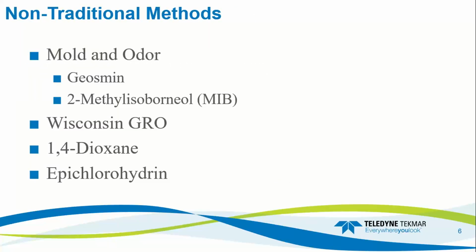Many of these non-traditional methods have little or no government-mandated methodologies for their analysis. So unlike traditional EPA drinking water or wastewater methods that are standard across all laboratories all over the country, and this is done just so that drinking water and wastewater meet a certain criteria no matter where you are. Often, for these non-traditional analyses, there's very little published guidance on how to run these applications. So most of the time, applications have been converted over from one of the more traditional analysis technologies like headspace or solid phase microextraction, SPME.